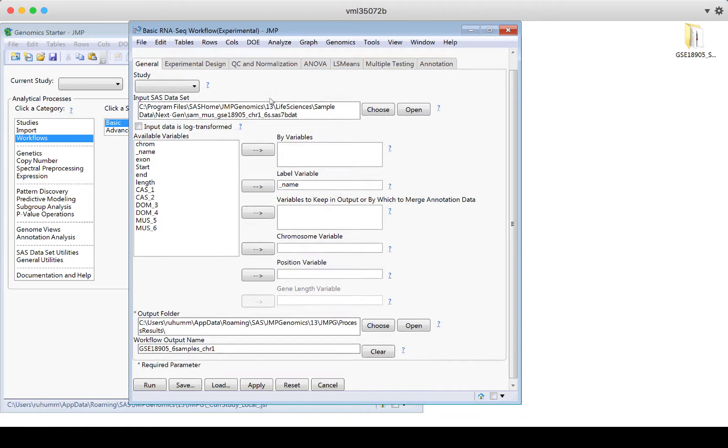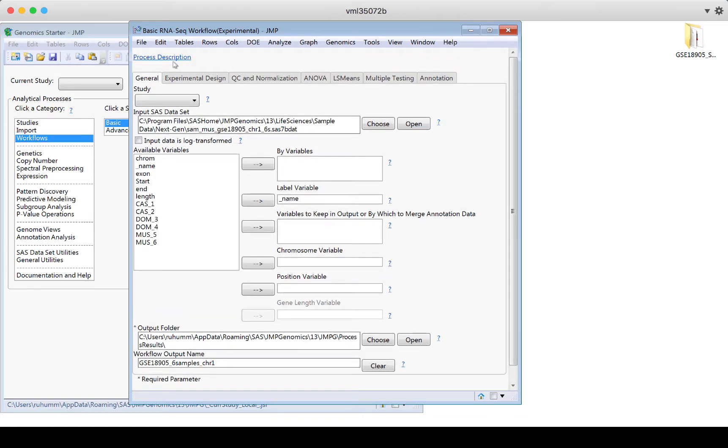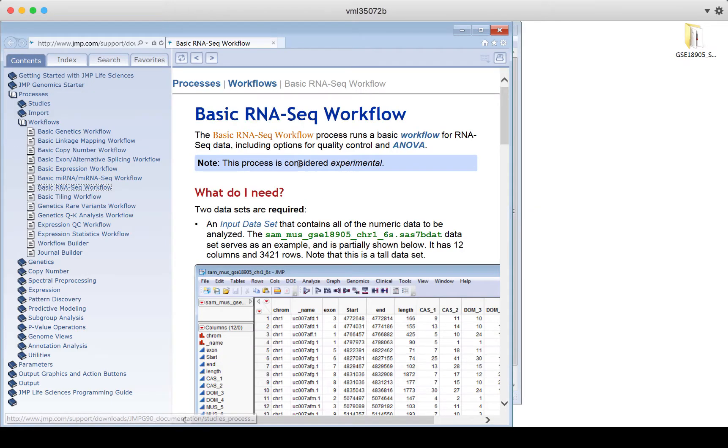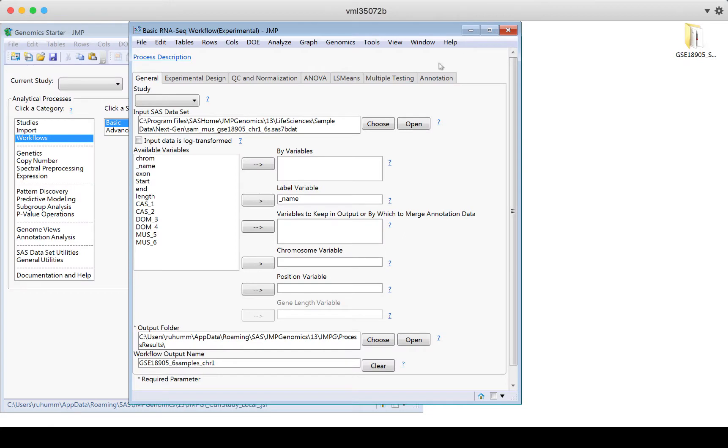Likewise, at the top, there's a process description button. This is another help that takes me to the whole RNA seek workflow. So if I click on process description, it's going to take me to that the big level of this entire platform. So the process description is a good way to get help. All the question marks are a good way to get help.